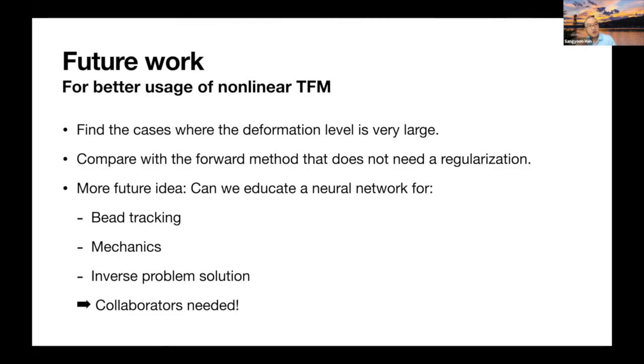Since we are using fluid mechanics knowledge, solid mechanics knowledge to do this TFM work, and also statistics, can we do it using deep learning? That is the future idea that I want collaboration with someone on.